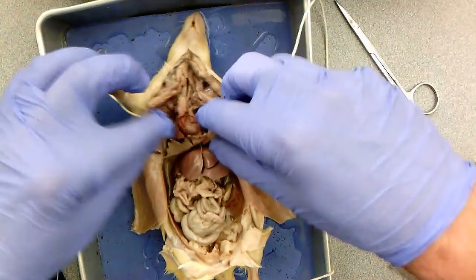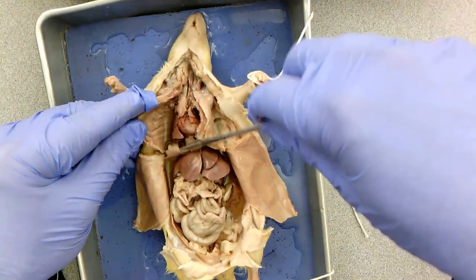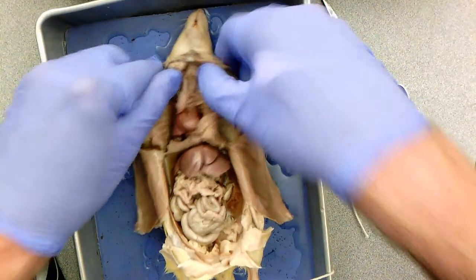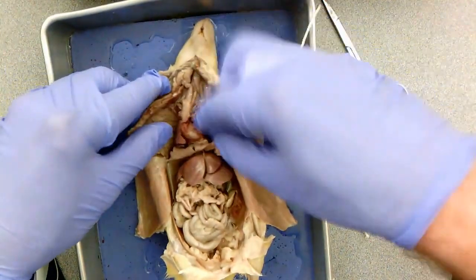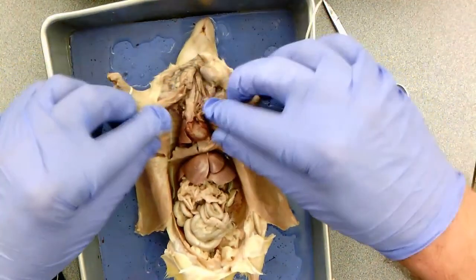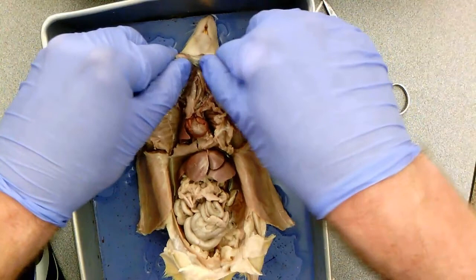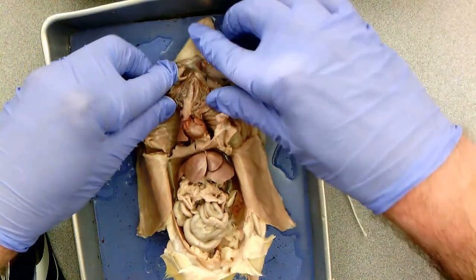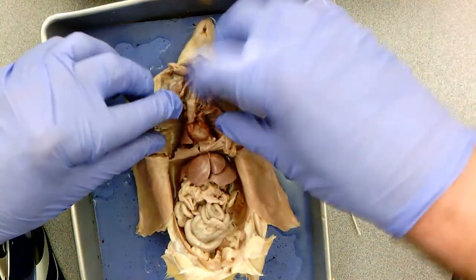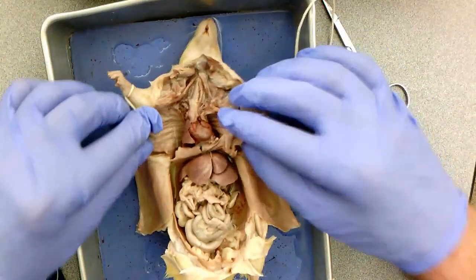You can see I have the diaphragm. You can see right here is the diaphragm that I was talking about, that muscle that's right there. Then you have some organs that you have to identify in this upper thoracic cavity. This would be part 3 of the lab, in which you're going to identify these organs of the thoracic cavity, as well as some organs and structures up here in the neck, mainly the trachea and the esophagus. If you can find the trachea, that's super cool. I want you to identify the trachea. If you cut that trachea and look directly behind it, you're going to see the esophagus as well.